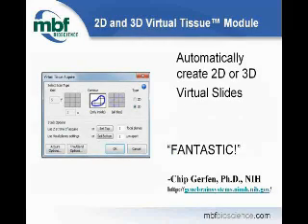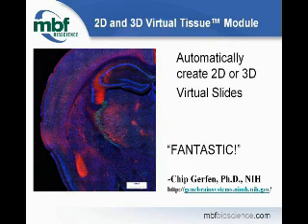We've been able to do 2D virtual slides for quite a while, and now with version 10, we've increased capacity by a great deal. 3D virtual tissues are now becoming very commonplace around here, and a number of users are using them now to collect large virtual tissue specimens that could be large-scale or multi-scale for qualitative and quantitative histological analyses. These 3D virtual tissue captures allow exhaustive 3D quantitative analyses to be performed on a sample. Digitizing the samples makes fluorescently labeled tissues available in a durable and portable digital form with no loss from the original image quality. And that allows multiple or repeat analyses to be performed readily.